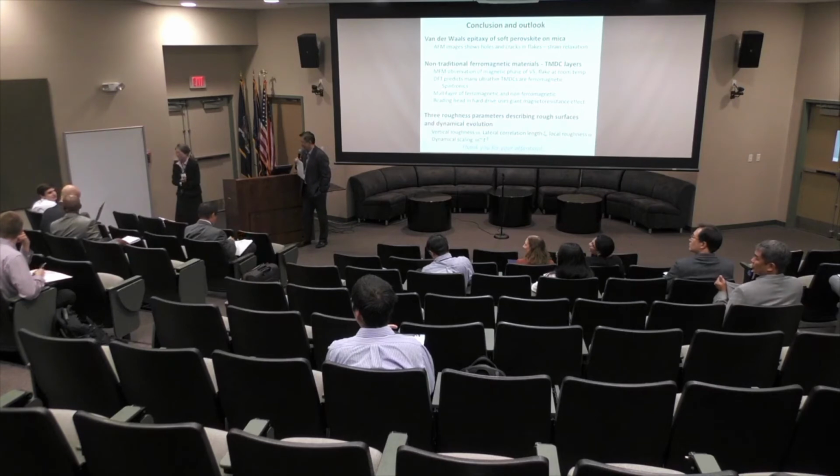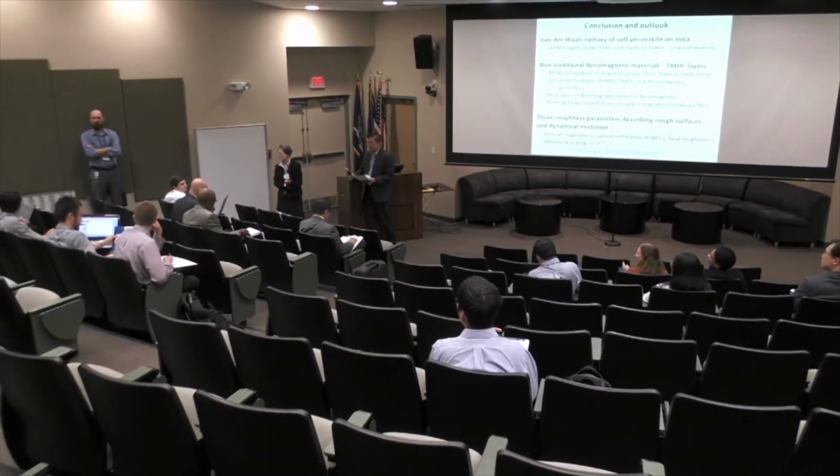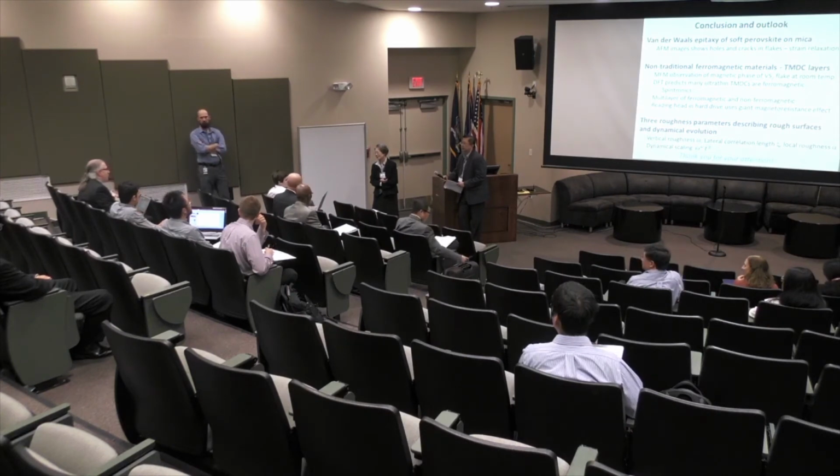The MFM data was very nice. So magnetic force microscopy is famous for not being very quantitative, as opposed to VSM. Have you done both VSM and MFM to try to compare?